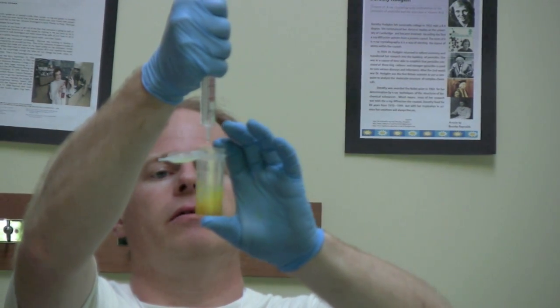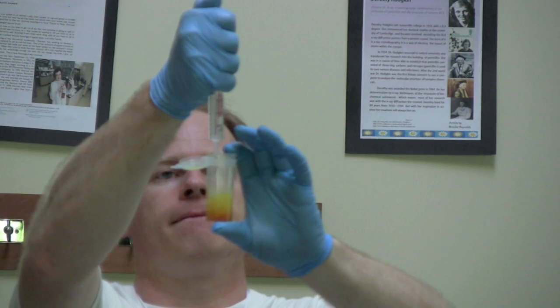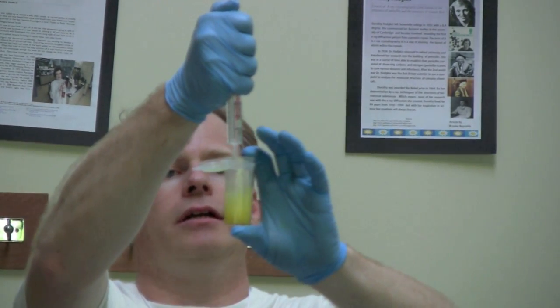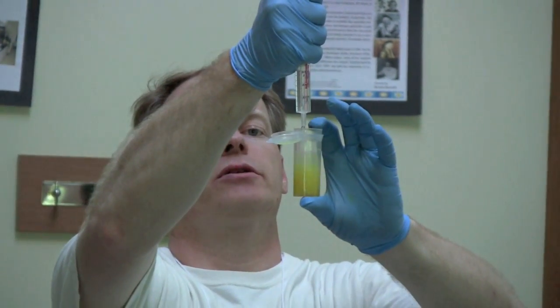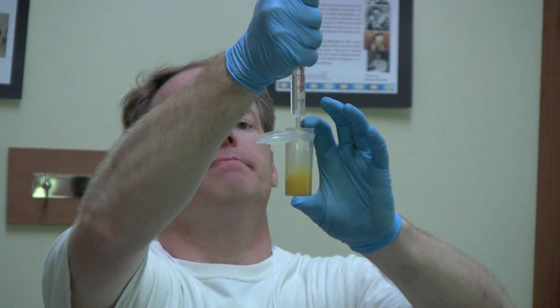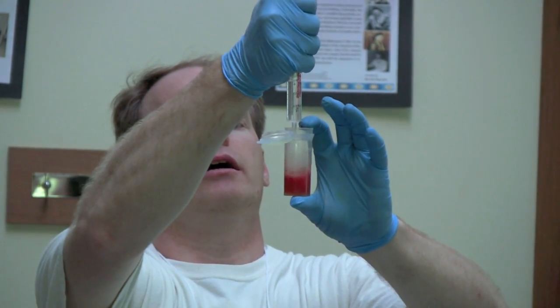It's starting to go a little red. What it does is it likes to go to it and then come back, and that's because it's neutralizing some of the acid. The acids are neutralizing the potassium, but then there's still more acids than there is potassium. There, we're getting to the deep red.